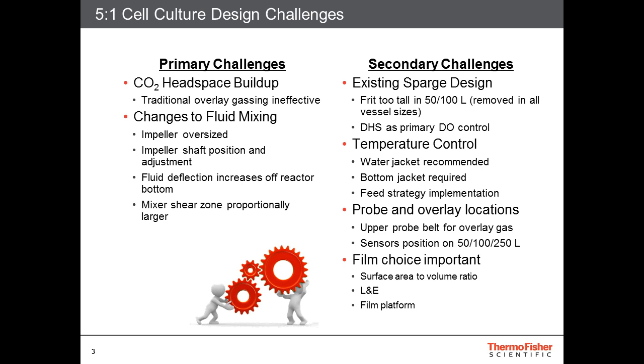So that is the process part of it. Otherwise, when you look at the dynamics within the whole system at 20% volume, the impeller size in the bioreactor could look oversized. The position of the impeller, the fluid movement within the bioreactor, especially when the volume is low, and the shear zone are some of the physical aspects that are important to understand.